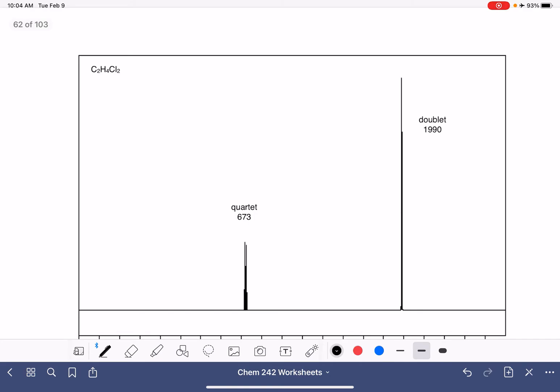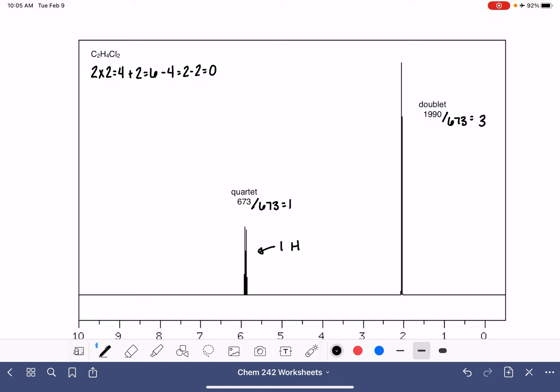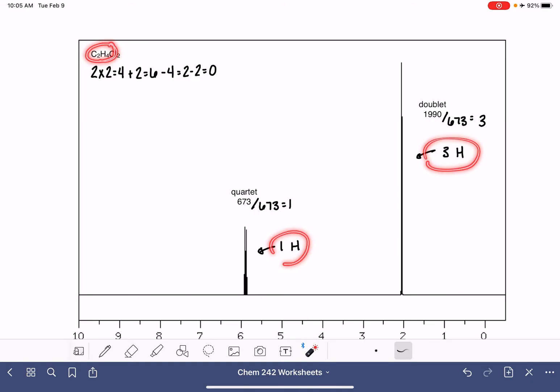For our second spectrum, we have C₂H₄Cl₂. Let's begin by calculating the HDI. 2 times 2 is 4, plus 2 is 6 — that's the maximum number of hydrogens — minus the 4 hydrogens that we have and the two chlorine atoms, giving us another HDI of 0. Now let's work on the integrals. We have 673 and 1990. 1990 divided by 673 is 2.95 — we'll call that 3. So the ratio is one hydrogen atom to three hydrogen atoms. We have a total of 4, and 1 plus 3 is 4, so our integrals look perfect.